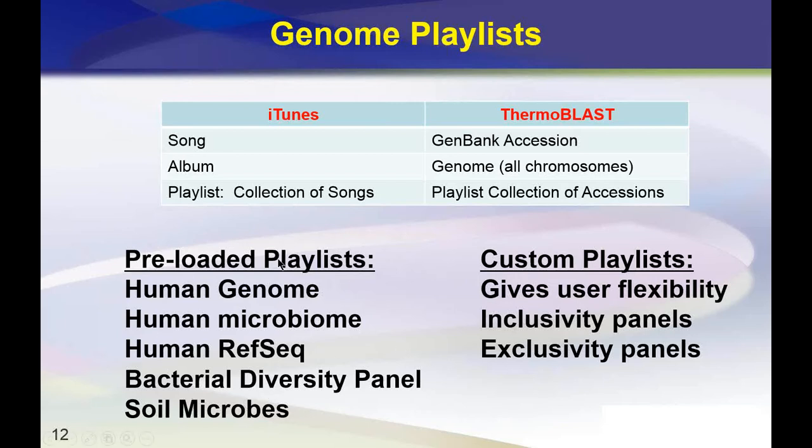Now, one of the nice features about these preloaded playlists is that you can mix and match them and combine them into larger playlists, and you can add your own customized playlist to those. So even sequences that are not found in GenBank, if you have your own proprietary sequences, for example, you can make your own custom playlist and combine them with the playlists that are available in GenBank.